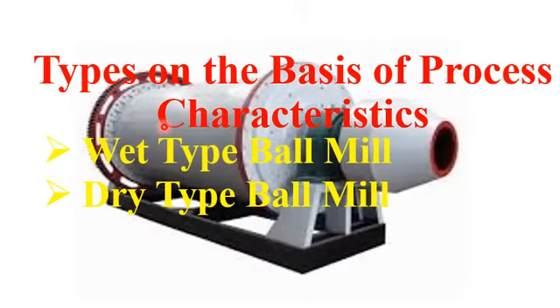So student, the sixth and very well-known type of ball mill apparatus, which is commonly used, is the ball mill apparatus based on characteristic. Based on characteristic, ball mill apparatus is divided into two types. The first type is known as the wet type ball mill apparatus, whereas the second type is known as the dry type ball mill apparatus.